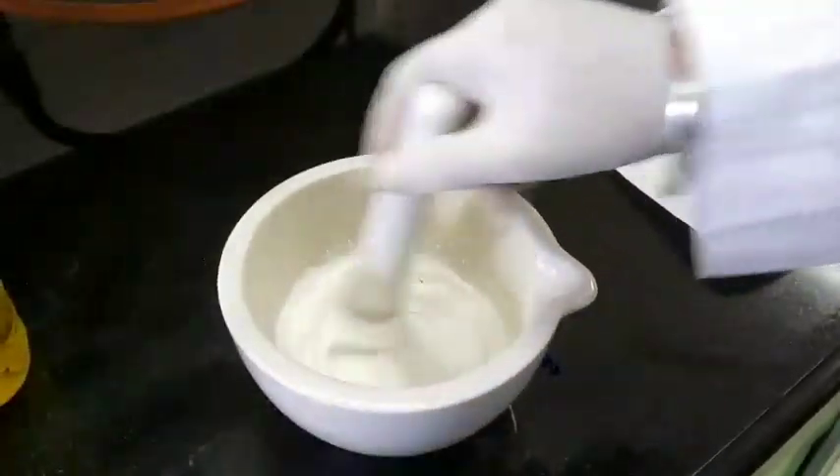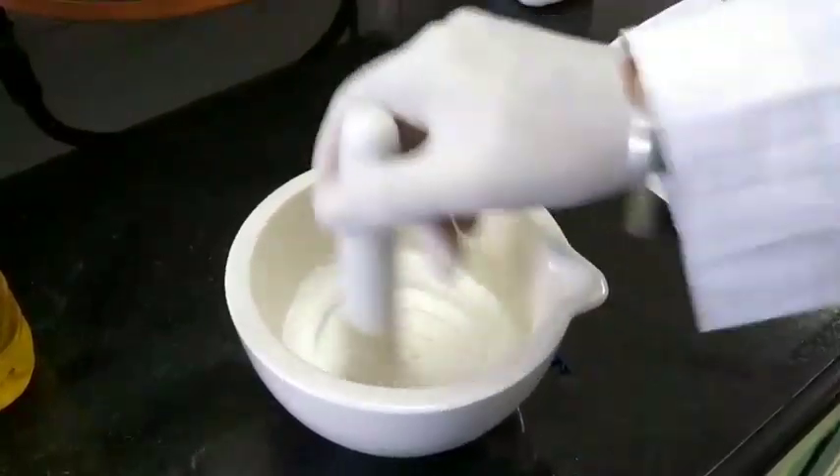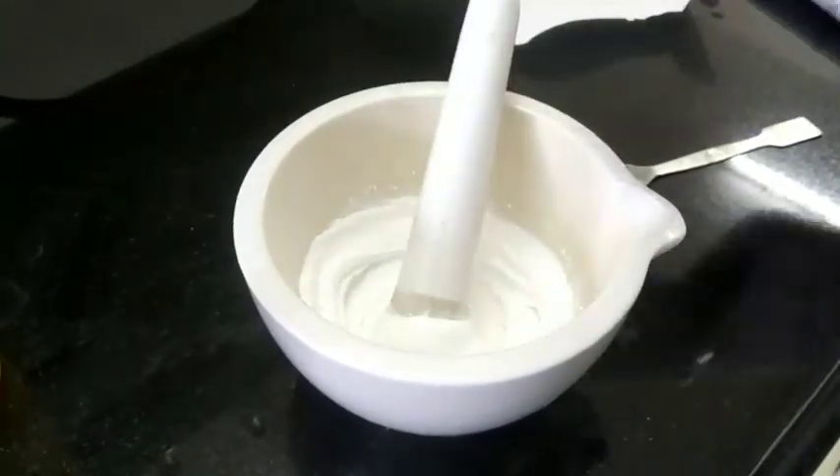Now incorporate the wool fat slowly by mixing. Now we are adding wool fat.